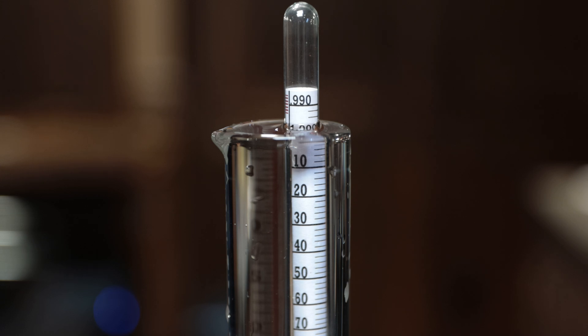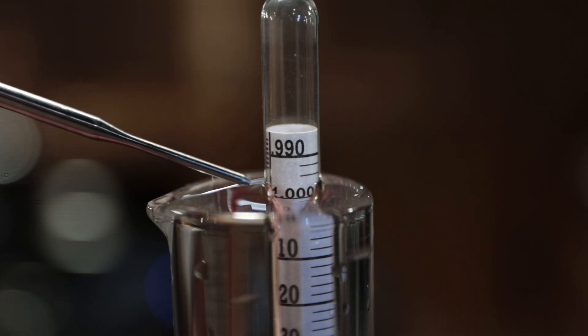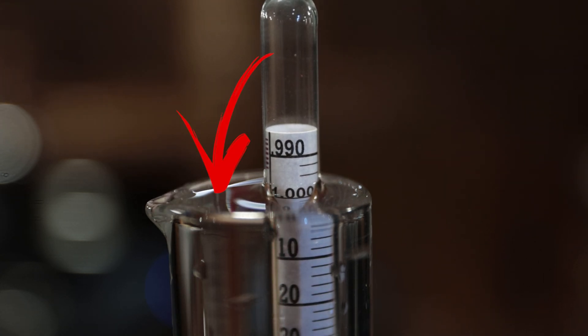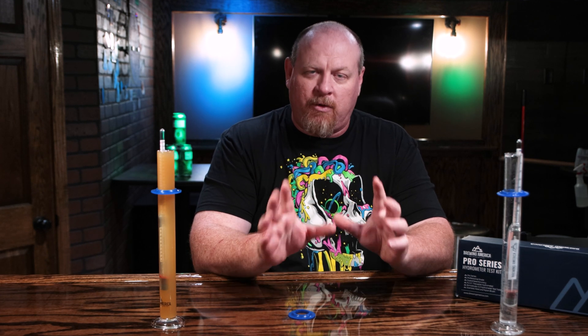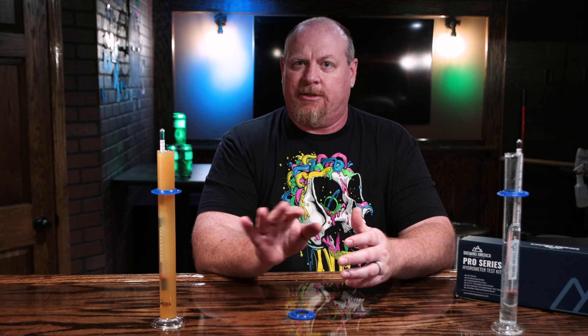Here's one thing you have to make sure you take note of: the hydrometer reading is not where the water or liquid bridges up the side of the hydrometer. There's a little slope where it comes up the side — you actually want to read the flat part, the very flat surface of the water, and draw an imaginary line from one side to the other on that flat spot. Here with a Brewing America hydrometer, as you can see, it's basically dead on 1.0000.